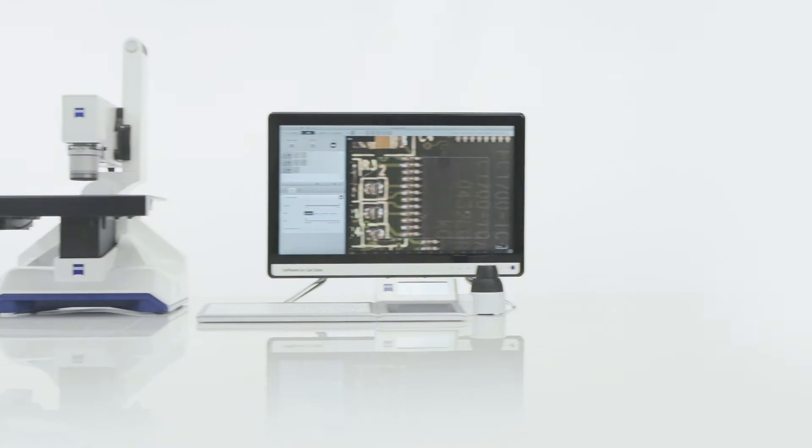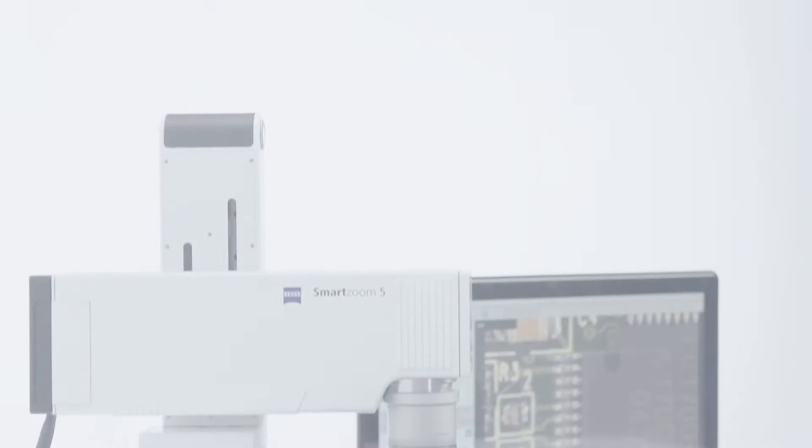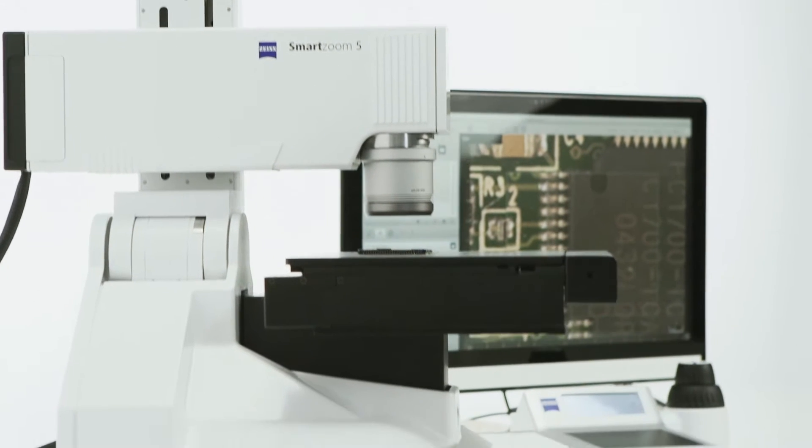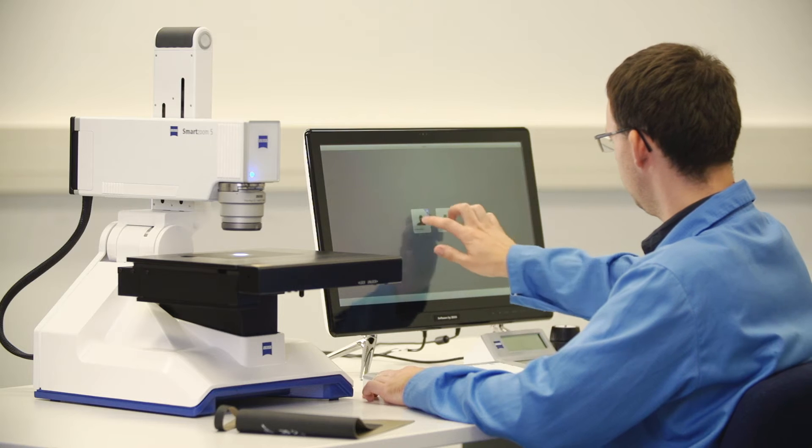Why waste time and energy examining machine parts to determine whether they meet specifications? You can do the job automatically with a fully motorized SmartZoom 5 Digital Microscope from ZEISS.